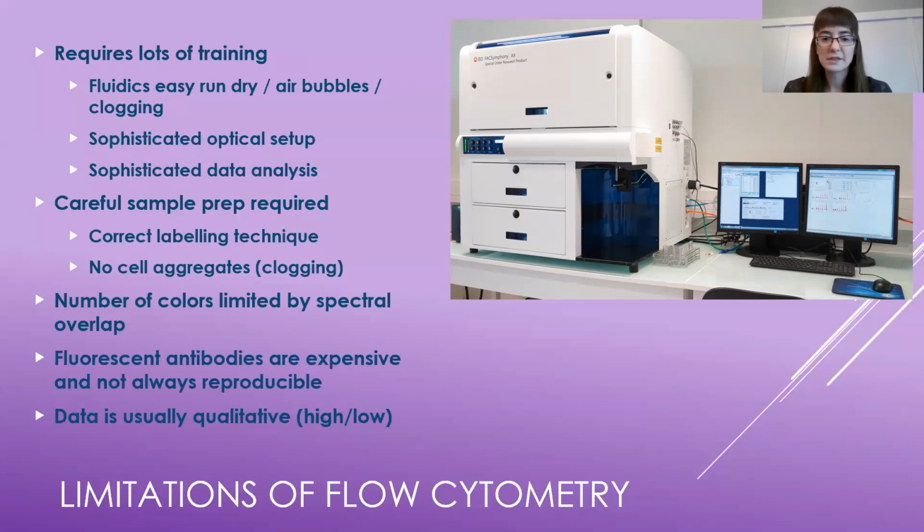All right, so that's it for today. After this, we'll be ready to do an activity for flow cytometry to learn more about how to choose color panels and how the instruments are designed. And then that's it. So now you should be able to at least be comfortable seeing flow cytometry appear in a paper and ready to interpret the data that you see.